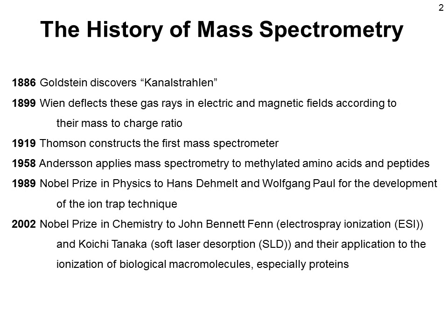Mass spectrometry has quite a history, as you can see from this overview. Already in 1886, Eugen Goldstein discovered the so-called Kanalstrahlen, or channel rays. In a gas discharge lamp, he saw that particles were formed that were traveling through the holes in the cathode straight on. That means that these particles had some inertia. Later it was shown that this was the first description of ions, and this was the basis of mass spectrometry.